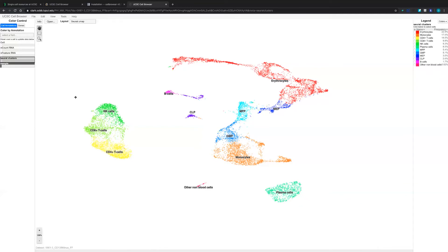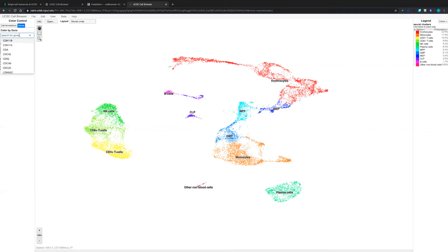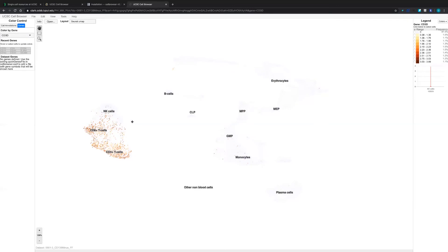Another thing we can do using this UCSC Cell Browser is check gene expression. From the left panel, there is a button named Genes. If you click Genes, the left panel will change so the color control panel will switch to color by gene. If you click the search for gene field and search any gene you are interested in — for example, the marker gene of T cells, CD3D — the middle panel will change. Cells not expressing this gene become light gray, and cells expressing CD3D are colored based on their expression level. The right panel also changes to show the expression level legend.